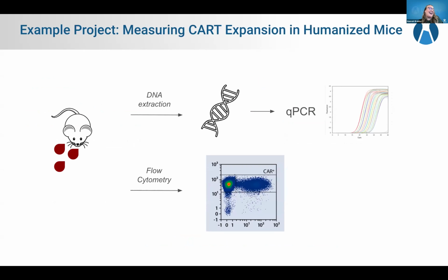I came from a correlative lab, collecting samples for CAR T-cell clinical trials. And I thought with Ty and Doug's presentation, it just made sense to stay here today. I'm going to make a very generalized example of what an experiment might look like, and then walk through that within the system.